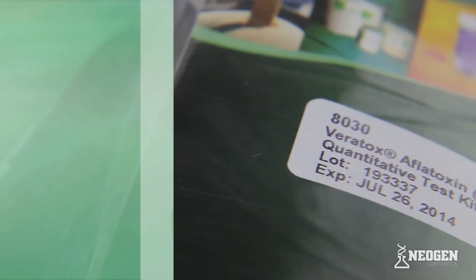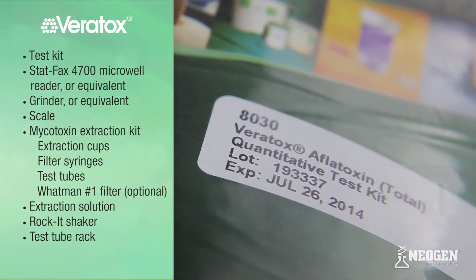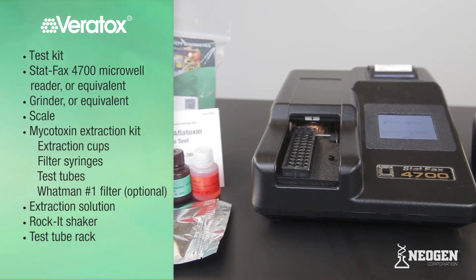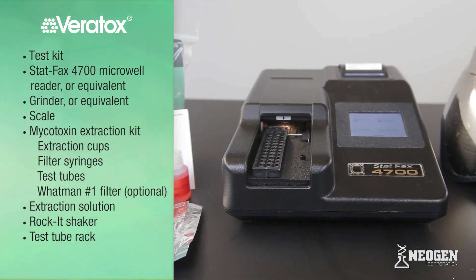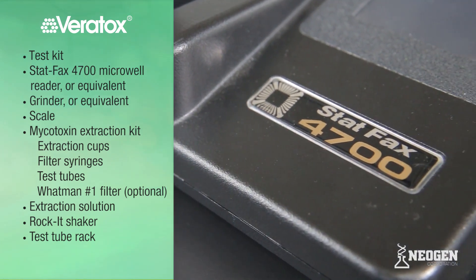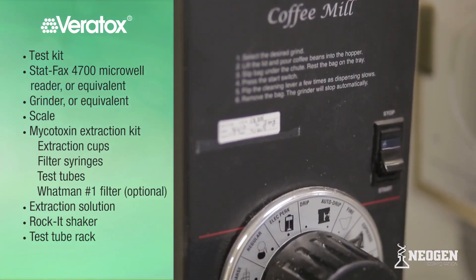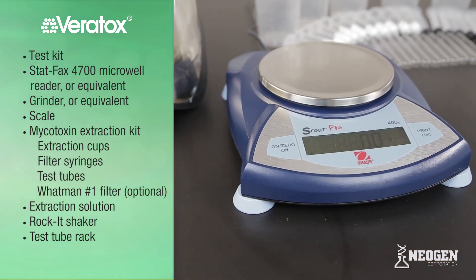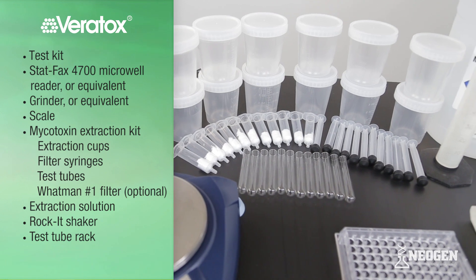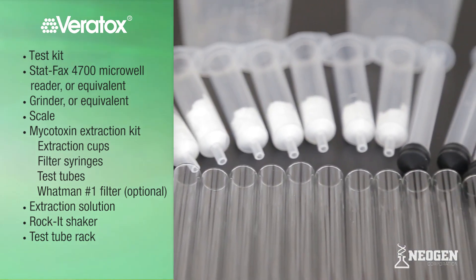To run Neogen's Veritox test kits, you will need the following supplies: a test kit, a StatFax 4700 Microwell Reader or equivalent — note that the reader should be plugged in and set up prior to running a test — a grinder or equivalent, a scale, and a mycotoxin extraction kit, which includes extraction cups, filter syringes, and test tubes.